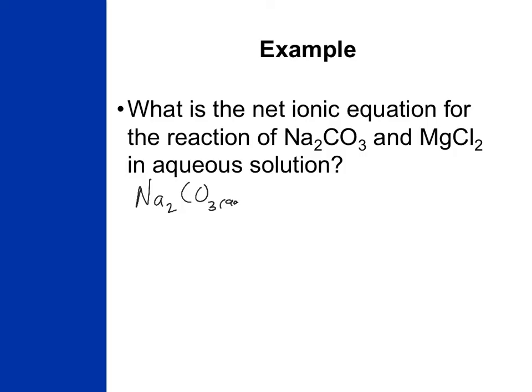Na2CO3 aqueous plus MgCl2. Remembering we need to put the phases. And it's going to form some kind of products. This is a point in which we often are going to look back at our solubility rules, which can be found in the appendix to our lab manual, and compare them with what kind of things we think we're going to form. First, I'm going to start off just by writing out our products using a displacement reaction.